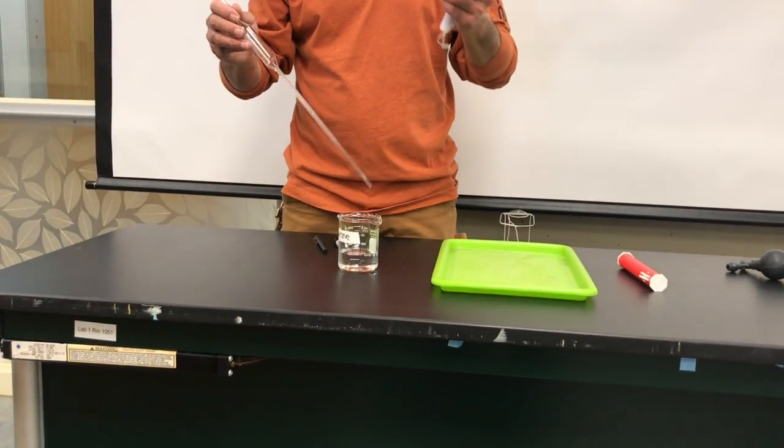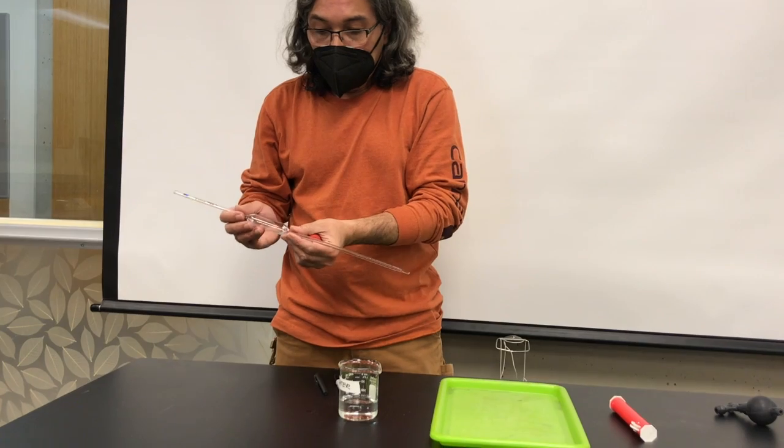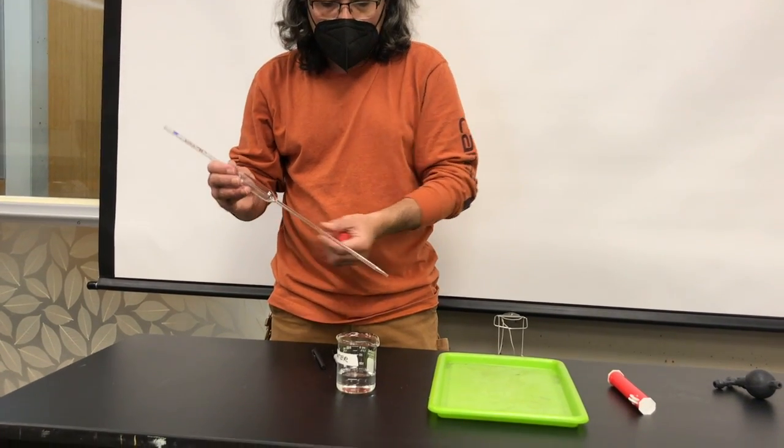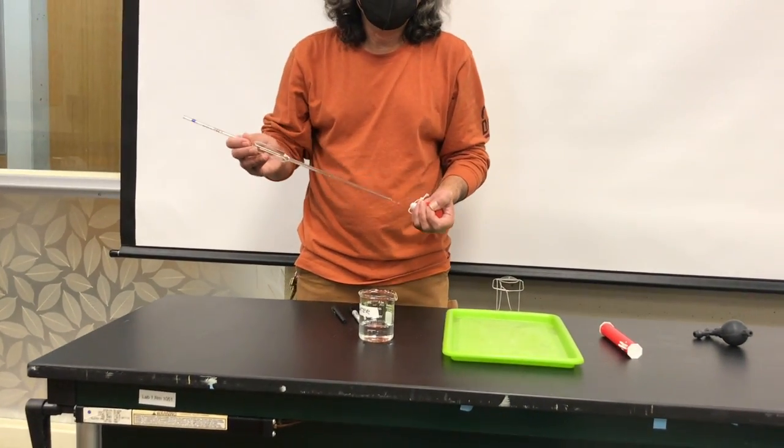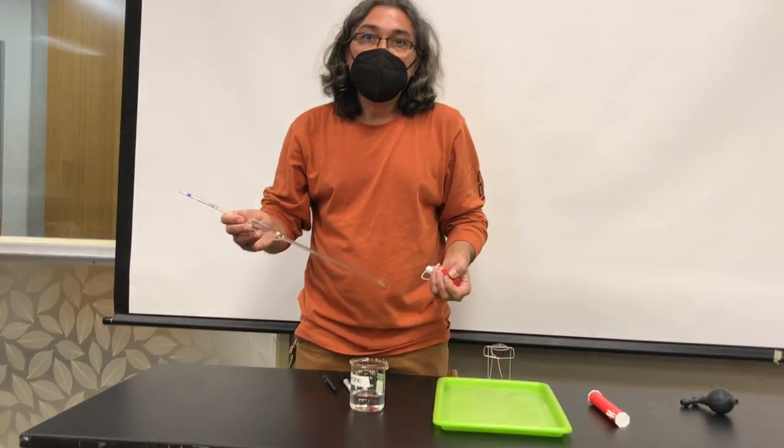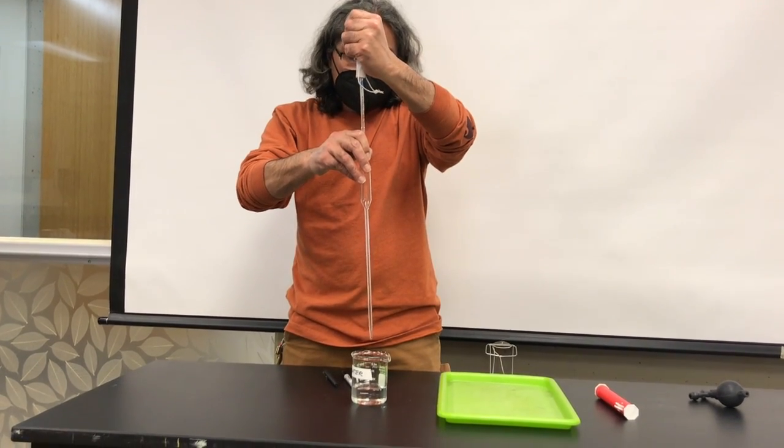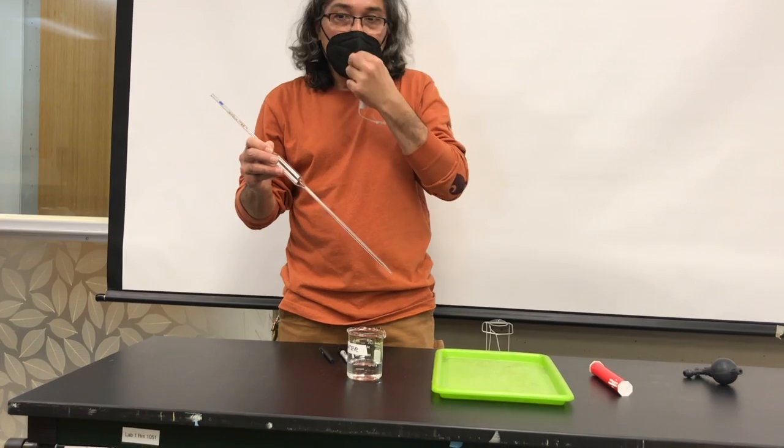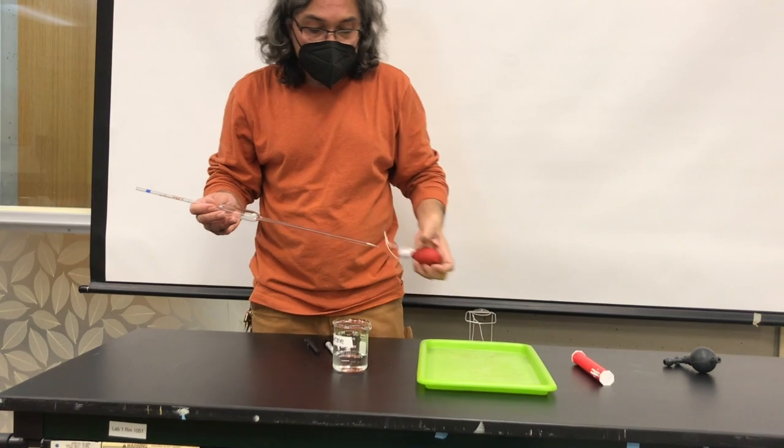This is why you don't want to blow the liquid out of the volumetric pipette, because if you did that, then you will end up with a little bit more than the 25 mls that you want. So if I went and did this to try to get all the liquid out, I will actually end up with a little bit more liquid than 25 mls.